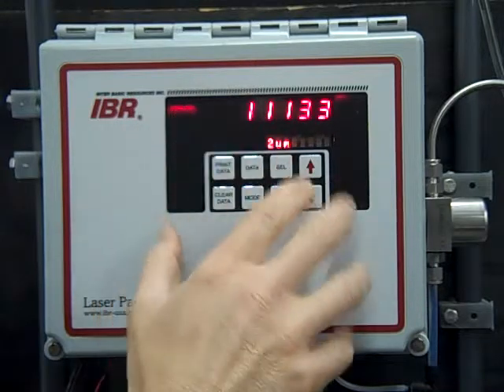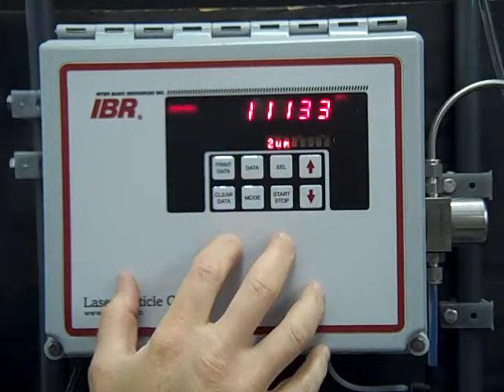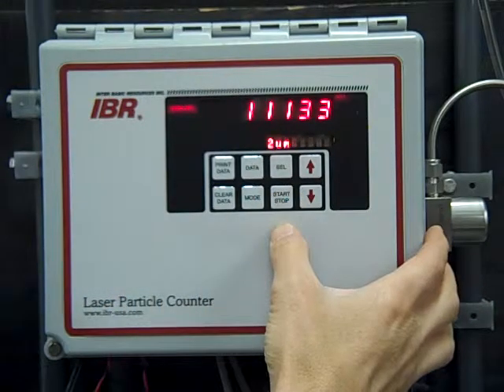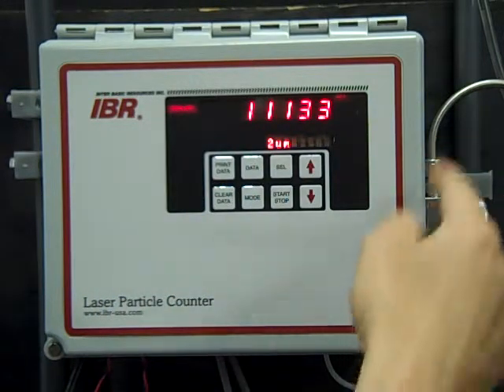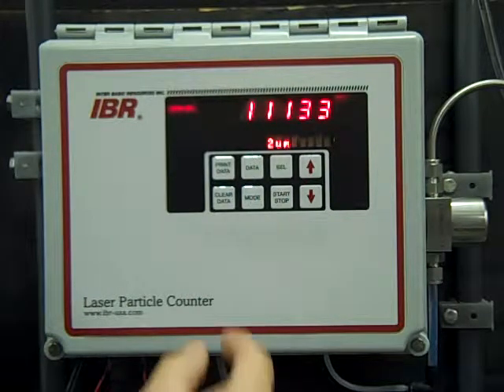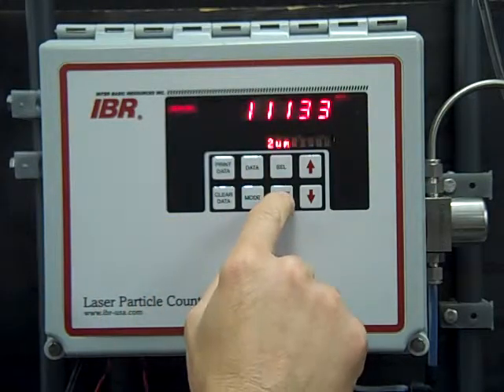setting the particle counter up at total counts, it's set for a 10-second count cycle. Now we'll press the start-stop key and the counter will run for 10 seconds, which means, as I said, 10 mLs of water will flow through the sensor. So this will be a 10-second count.